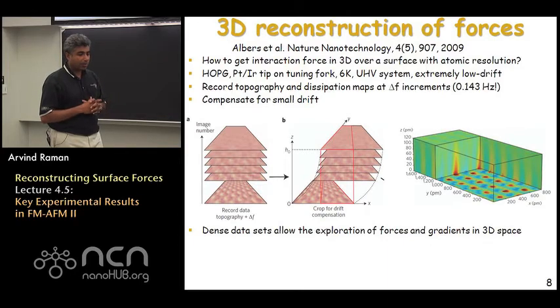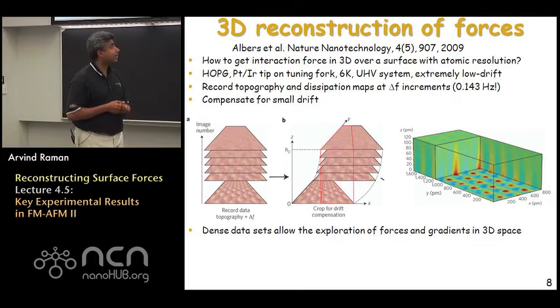A key way to overcome this was proposed by Udo Schwarz's group in 2009 when they studied freshly cleaved HOPG in ultra-high vacuum conditions at very low temperature.